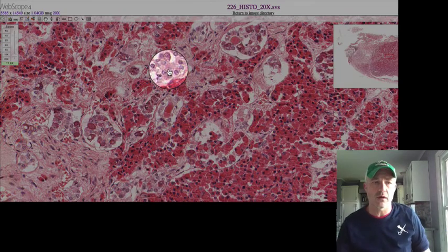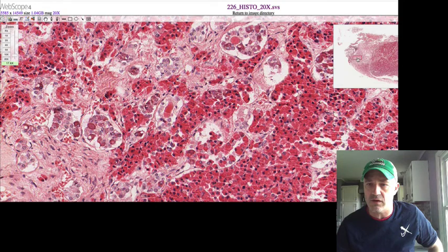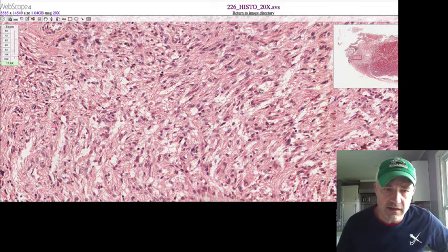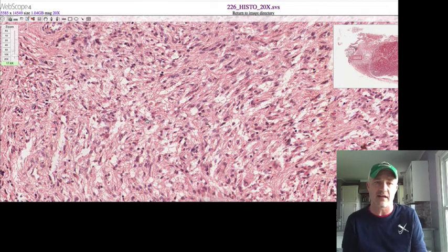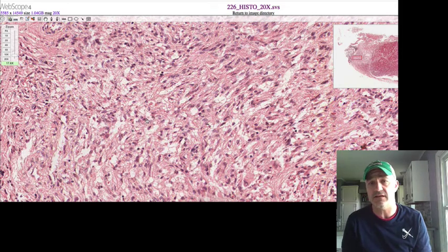If we then scroll ourselves over to the posterior pituitary, again, you can see mainly these nuclei and other things like that. I don't think I would expect you to try to identify a Herring body or anything else like that, but these are mainly neuroglial cells and axons that are present in this one. But if I showed you this, I do expect you to be able to look at this and say, hey, this is actually the posterior pituitary.